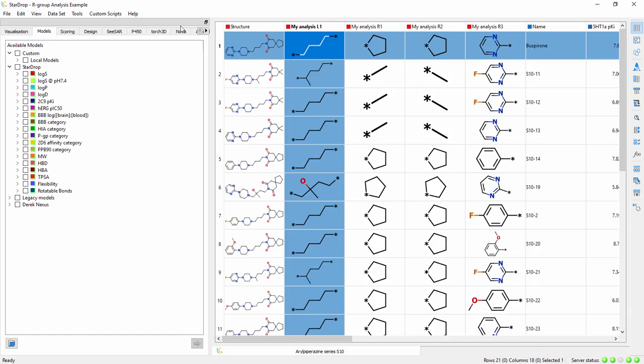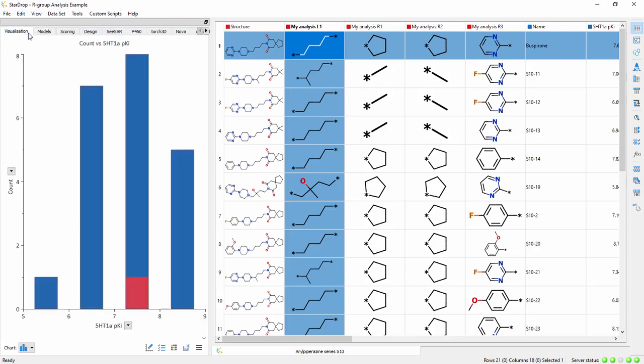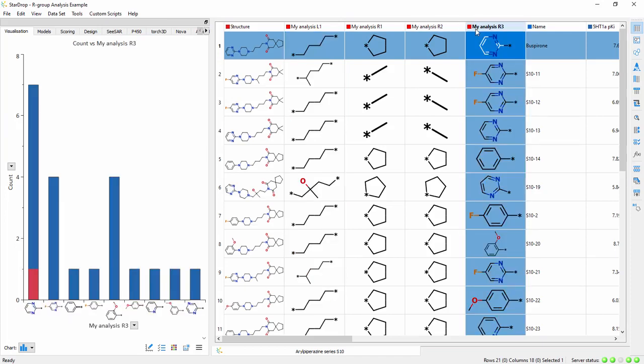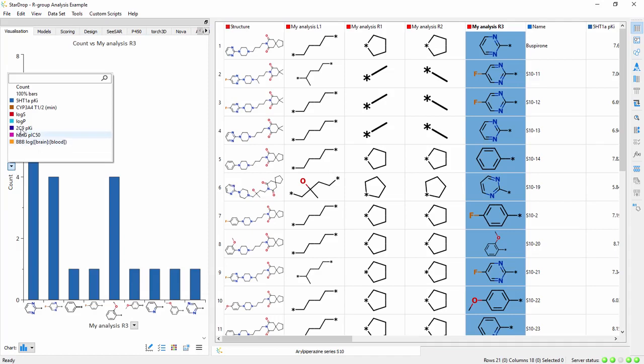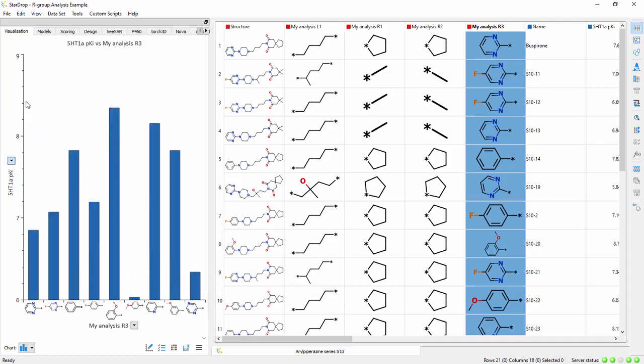These R-group analysis columns can be visualized just like any other data in StarDrop. Selecting a column corresponding to a point of variation will display a histogram showing the number of compounds with each substituent. Choosing another property on the y-axis will show the average property value for compounds with each substituent in that position.